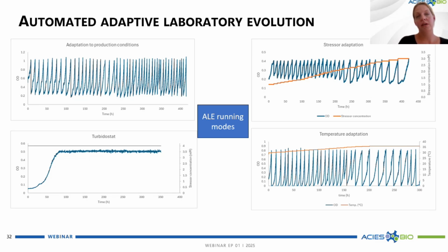In this case, you also screen for the length of the cycles, so how much time passes between one passage and another. If you see that this time is getting too long, then the strain is really struggling, and maybe you need to decrease the increasing steps a little bit, or you have to keep the strain on the same concentration for some time.